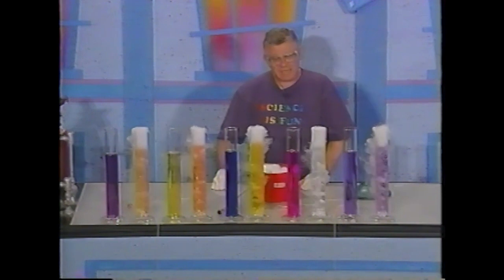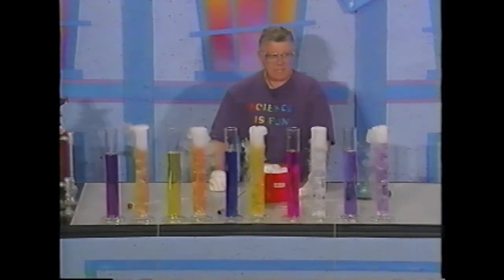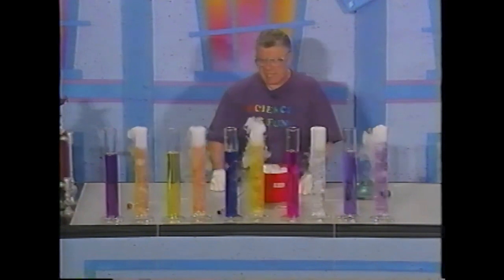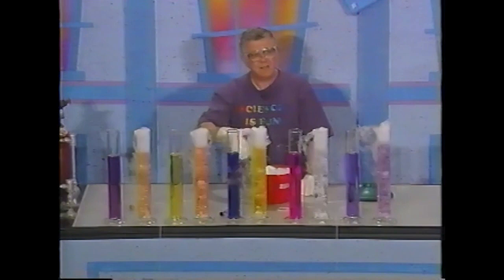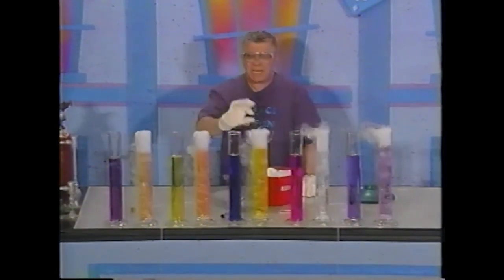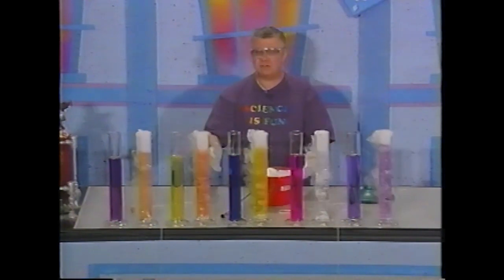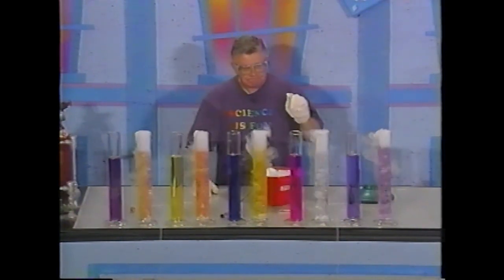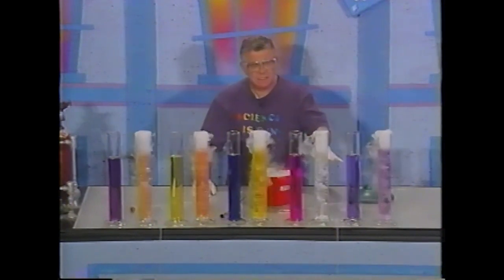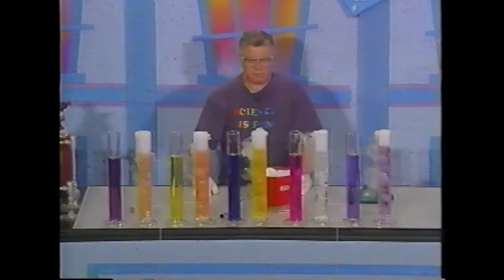Carbon dioxide gas combines with water to form carbonated water, and that forms carbonic acid. And these different colored liquids have added to them dyes that change color when the pH of the solution changes, when the pH of the liquid changes. pH is a measure of how acidic or basic a substance is. In this case, the carbonic acid is combining with a household ammonia that I put in those cylinders before we got started.